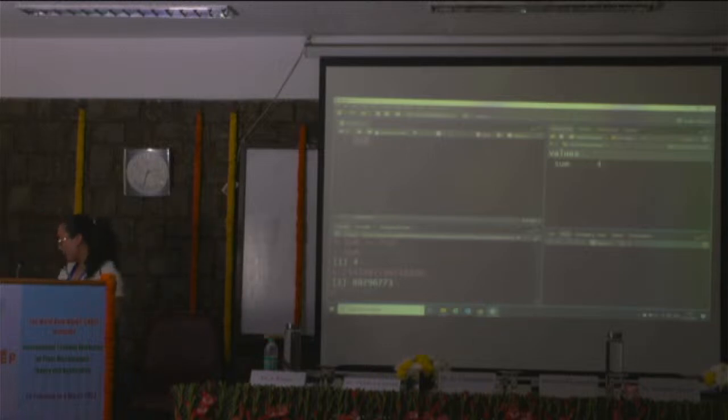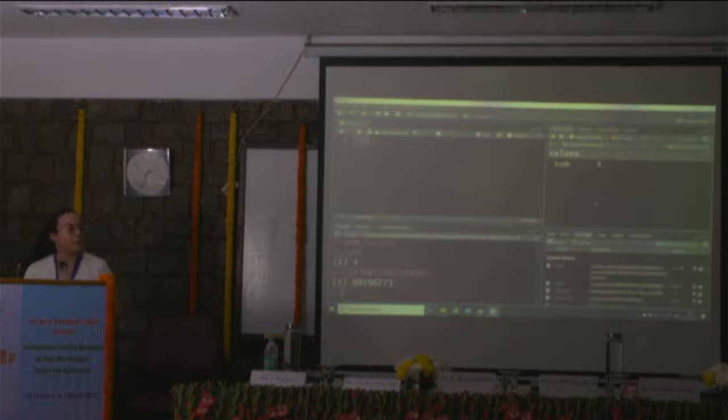The other thing is packages. So I think some of you are already familiar because you were trying to install with this. This is the list of packages that are available for download in a basic manner, but you have to keep in mind that in biology, we don't use it in a basic way. We use it for a specific analysis for biology, and we use packages that other people create and that the creators of RStudio just didn't do. So that's why this is not complete, and Guillermo was saying that to you. But you can find a great deal of packages in here.